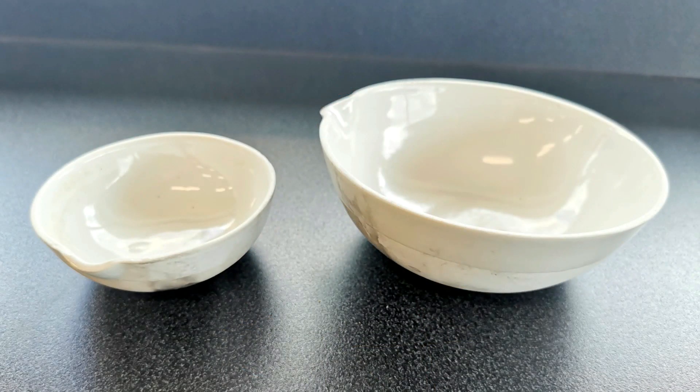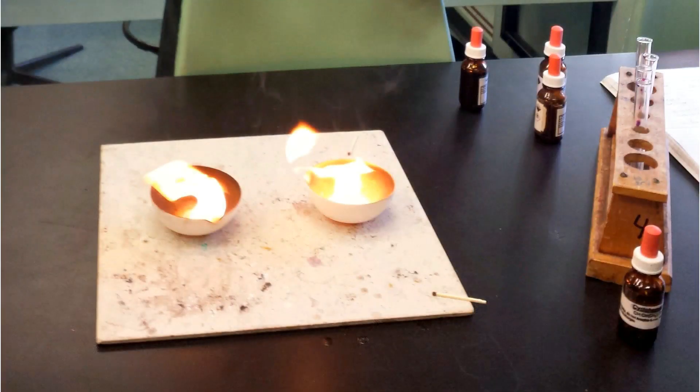These two are evaporating basins of different sizes — one large and one medium. You could put a salty solution in there, leave it overnight, and come back the next day to find just salt remaining once the water has evaporated. You don't have to use them for evaporation — in this case we were testing how cleanly different compounds burn: cyclohexane and cyclohexene. You can see the compound on the right was burning much more cleanly, with a lot less soot inside the evaporating basin.